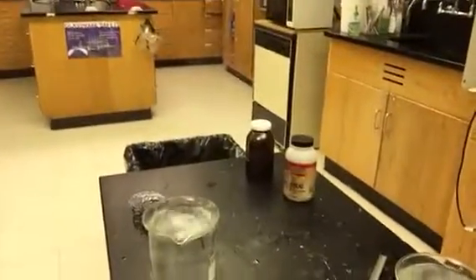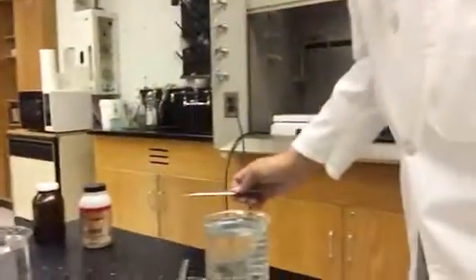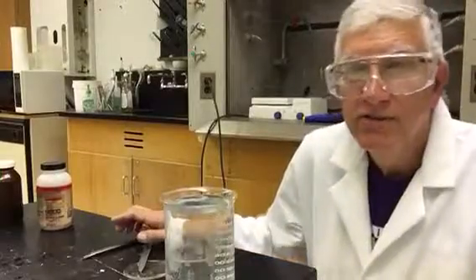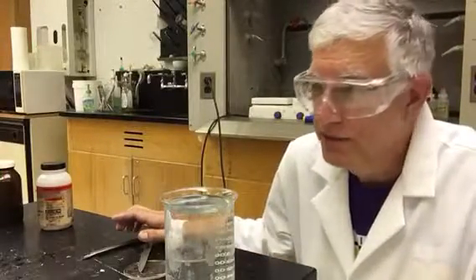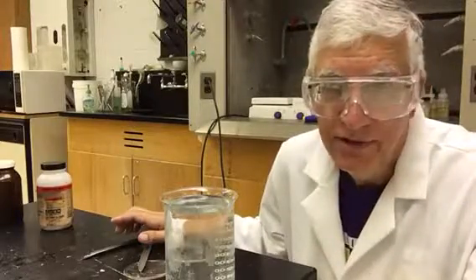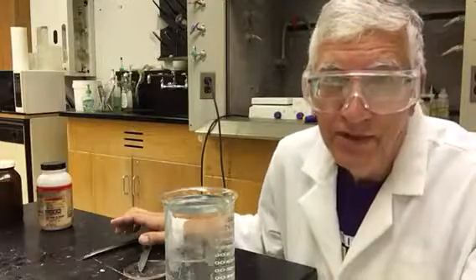It actually catches on fire. Had quite a violent reaction, very rapid, burning. And you may also have noticed that both of those were solid chunks of metal, but they floated on top. They're less dense than water, so very reactive and have characteristic colors. That's the alkali metals. They are all like that.